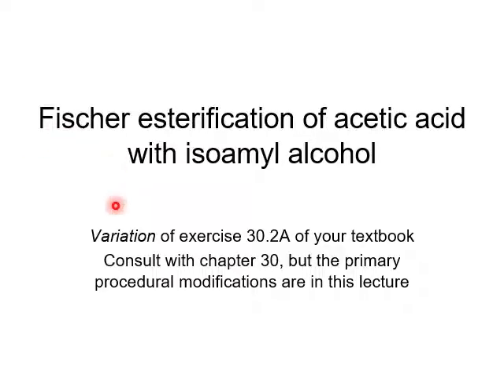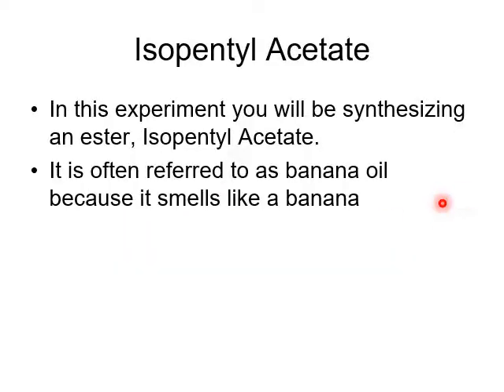Hello everyone. Our experiment today is a Fischer esterification of acetic acid using isoamyl alcohol. In this experiment you will be synthesizing an ester, isopentyl acetate. It is often referred to as banana oil because it smells like a banana.